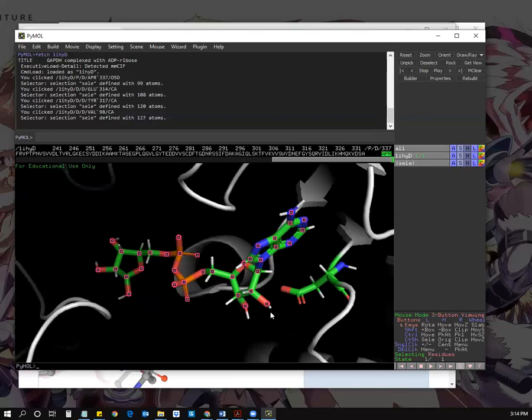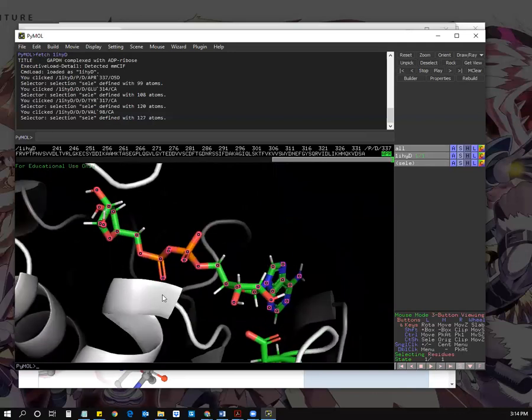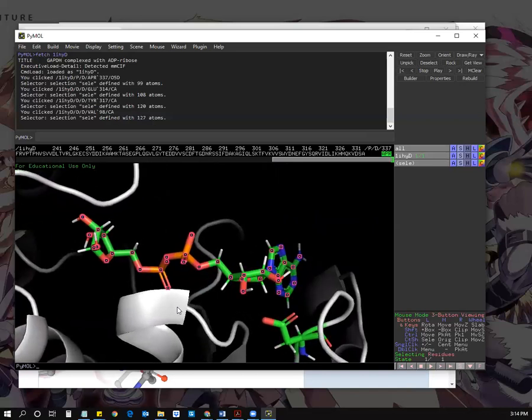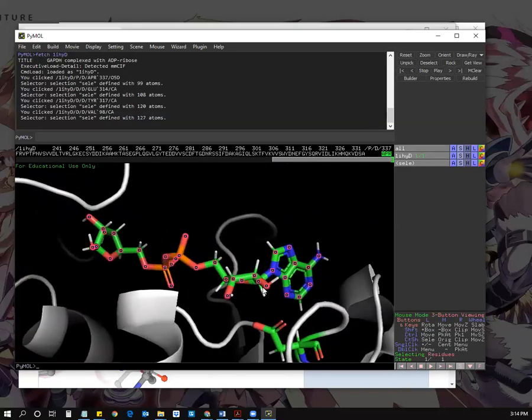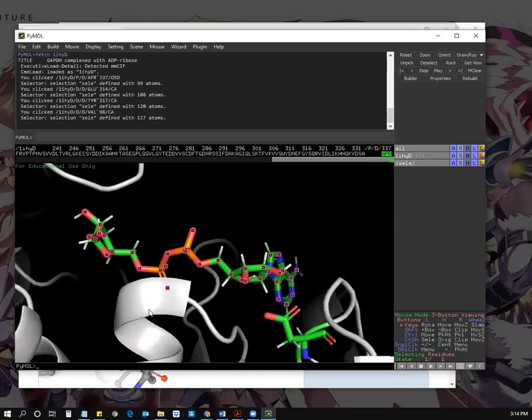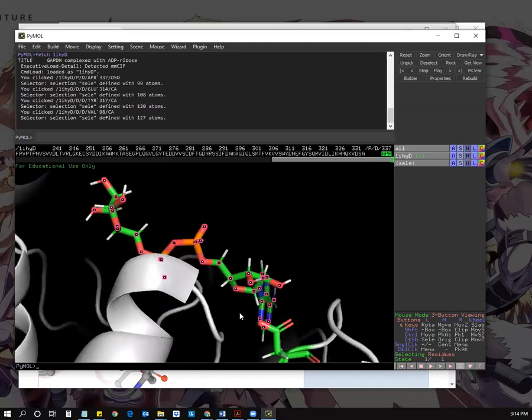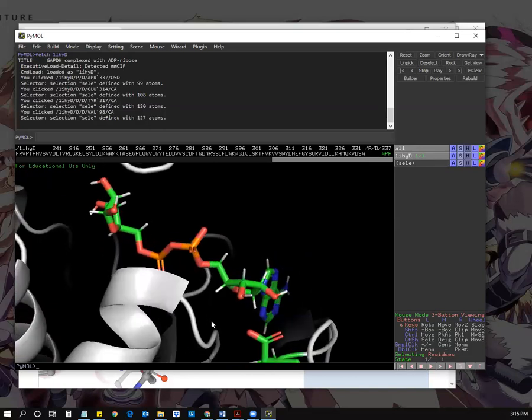All right, so we're almost done with prompt 5, except we need to document a hydrogen bond distance. And so I think if we look back at the interaction 3D diagram program, this deprotonated oxygen off of the carboxylic group in aspartic acid looked like it was interacting between these two hydrogens here. So I'll just focus on one of the hydrogens in the hydroxyl groups in the ribose sugar itself, and I'll just choose this one, the one that's closest to us, closer to the diphosphate groups rather than the one that's closer to the adenine ring.